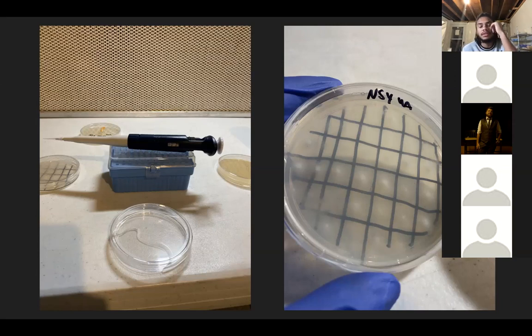So what I did with this is I'll turn the petri dish over and I'll draw a grid on the bottom, and then I'll take distilled water. I sterilize distilled water in a jar in a pressure cooker, and I just do that for 30 minutes at like 15 psi, and then take your pipette, change it to like 50 microliters or like 100 microliters.